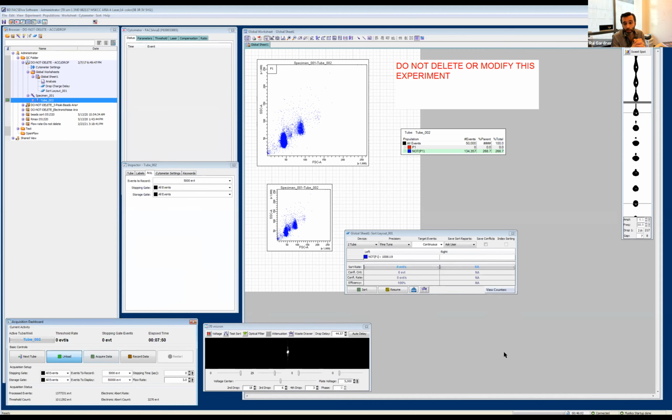So when you do it automatically, you risk it calculating the wrong drop charge delay if all these things are not well calibrated. That's something you will spot quickly manually. If it doesn't sum to 100%, you will immediately detect that and know that whatever measurement comes out is not the correct one. So that's why we find doing it manually is much better, as long as you know what you're doing.